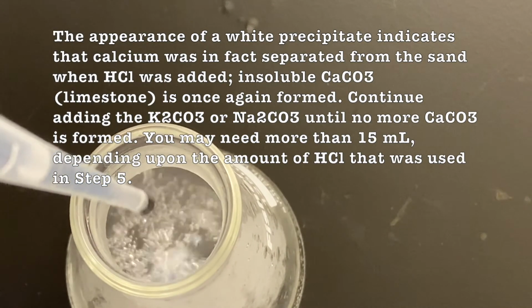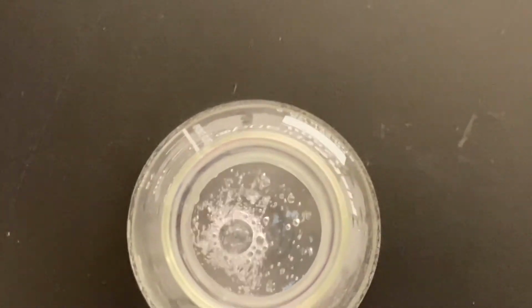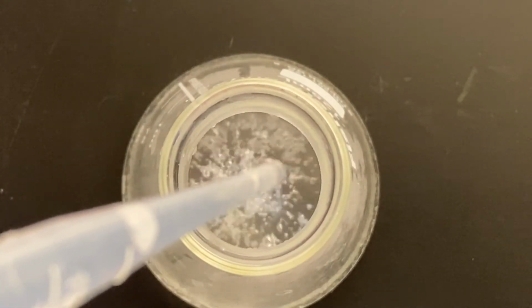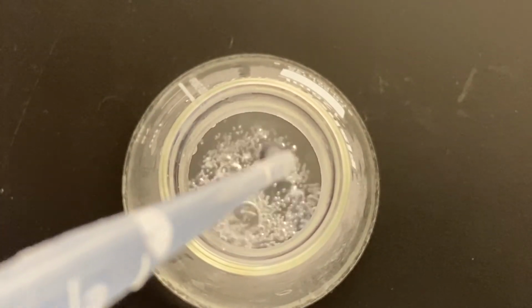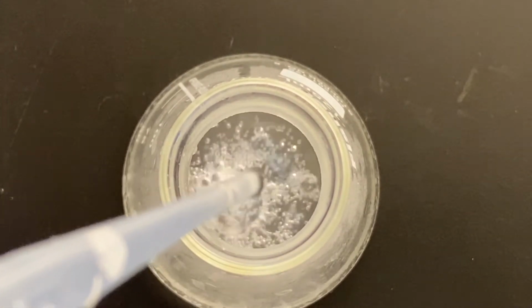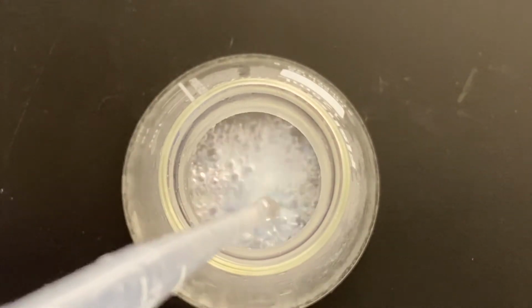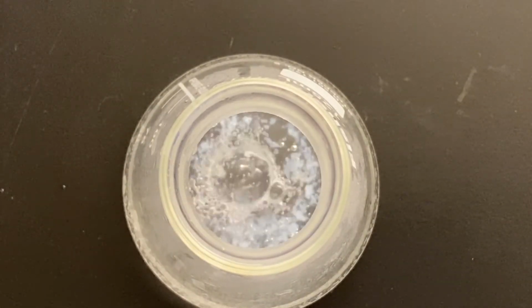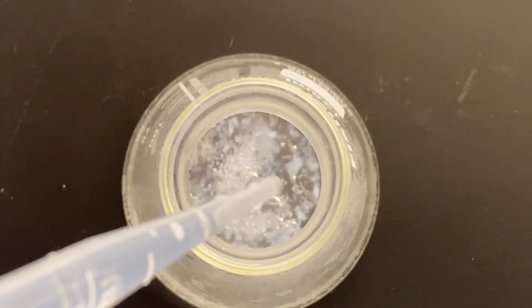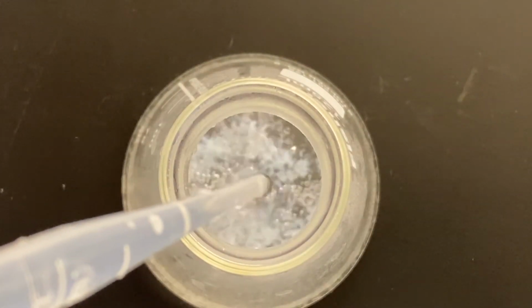So you can see we're adding the sodium carbonate. You can see it's forming bubbles, and you're also seeing a little bit of precipitate there. What's going on is the carbonate in the sodium carbonate is getting converted into carbon dioxide. And in the solution, there are some localized pockets where the carbonate concentration is high, and that's causing it to precipitate with calcium.